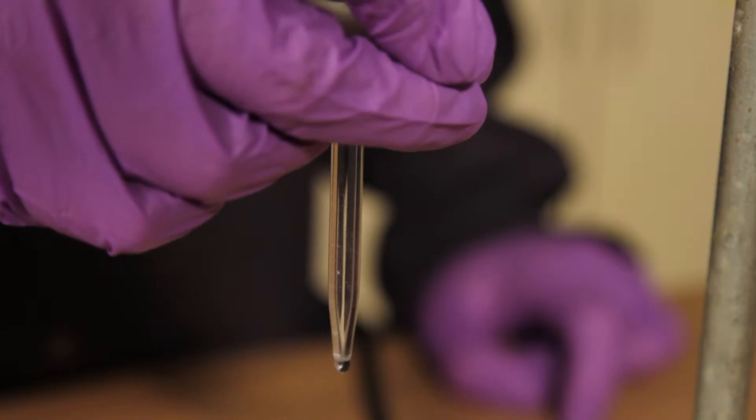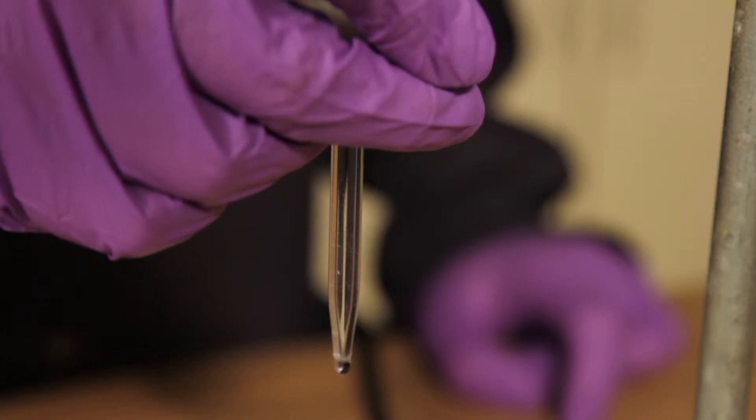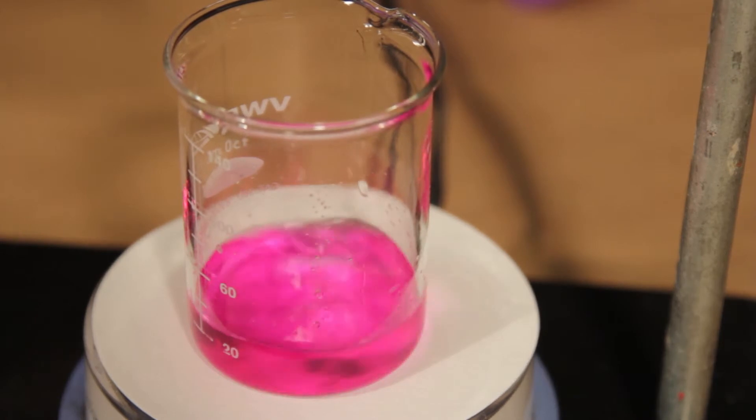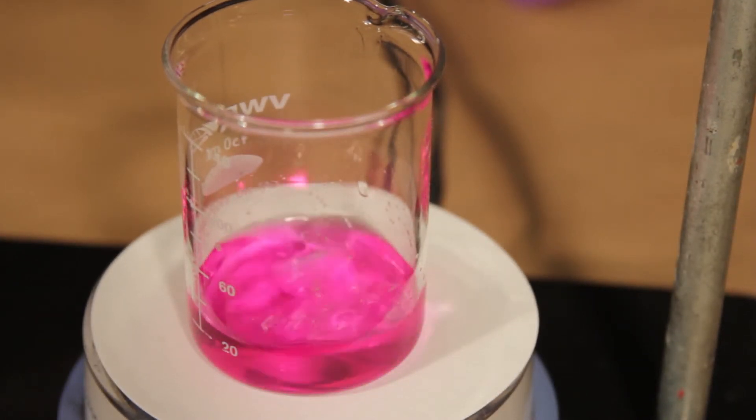The amount of indicator is approximate. If you add a few drops more, it does not change the titration end point, but intensifies the color produced, making it easier to see.